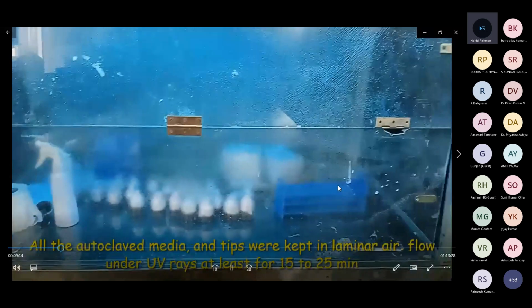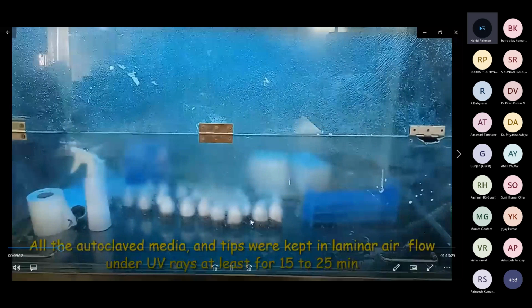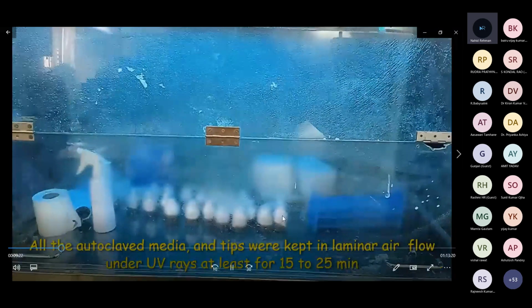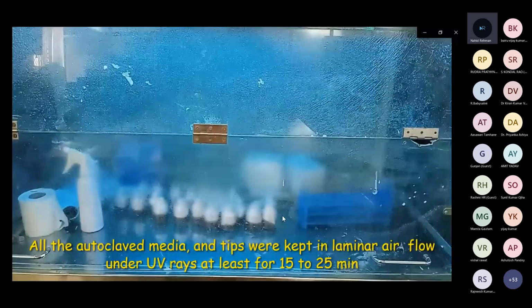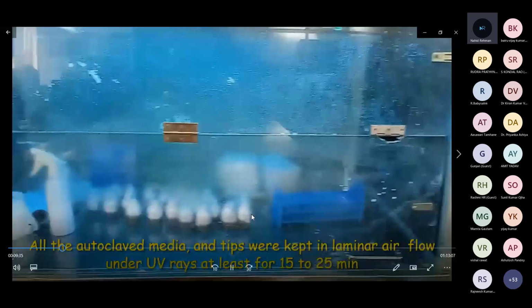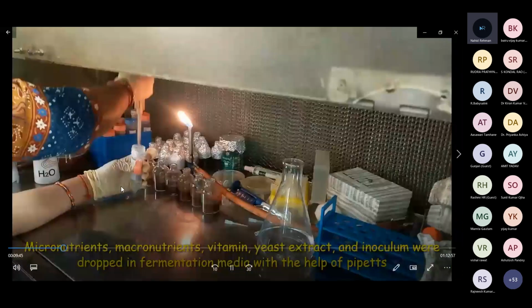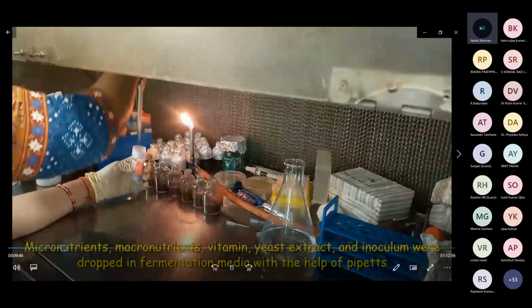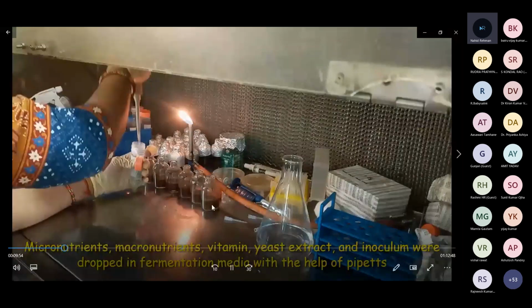So the students have just kept the serum bottles which are of capacity 60 ml. This is the most appropriate vessel which is being used for laboratory scale biohydrogen production experiments. And you know that these are the autoclaved bottles. This one here you can see. So Miss Priya is performing. She is transferring the micronutrients after the autoclaving of these substrates.